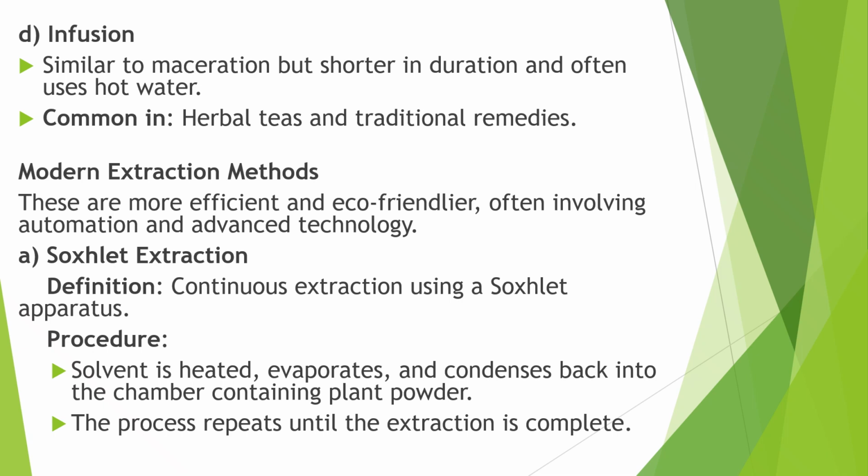Continuous extraction using Soxhlet apparatus. It's an apparatus made up of glass. Different portions are there. Condenser is there. Specific round bottom flask is there. Soxhlet apparatus is there as a whole. You have to fix up the unit and then go forward for the extraction process. That's what we can do along with the Soxhlet apparatus wherever we are carrying out our extraction process.